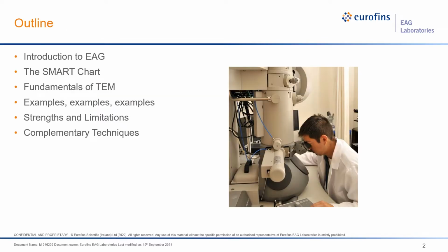So today's webinar, we're going through the following items. We're going to introduce you to EAG, and then we have the smart chart, which is kind of like a roadmap for you to choose the right technique. Then go through the fundamentals of TEM. It's just a couple of slides, and then go through examples.